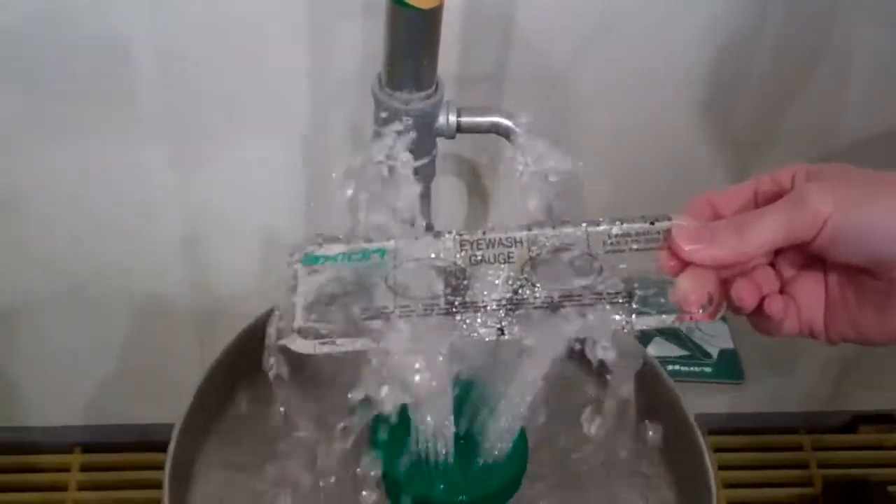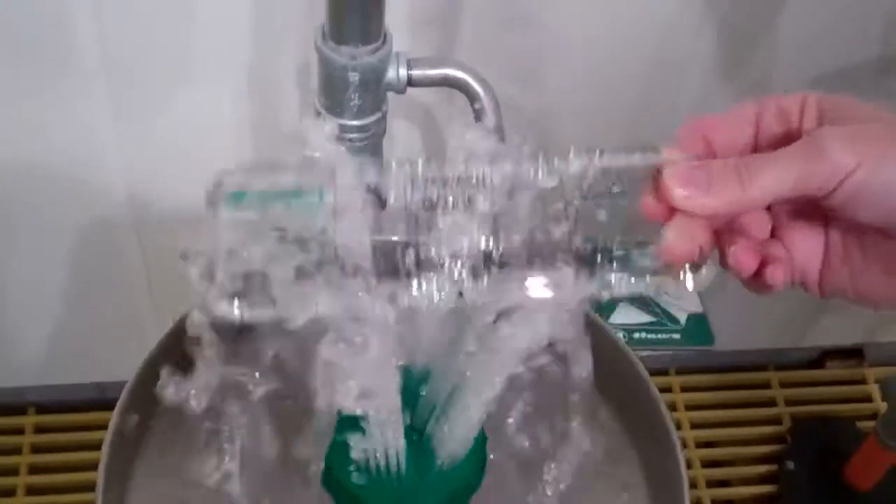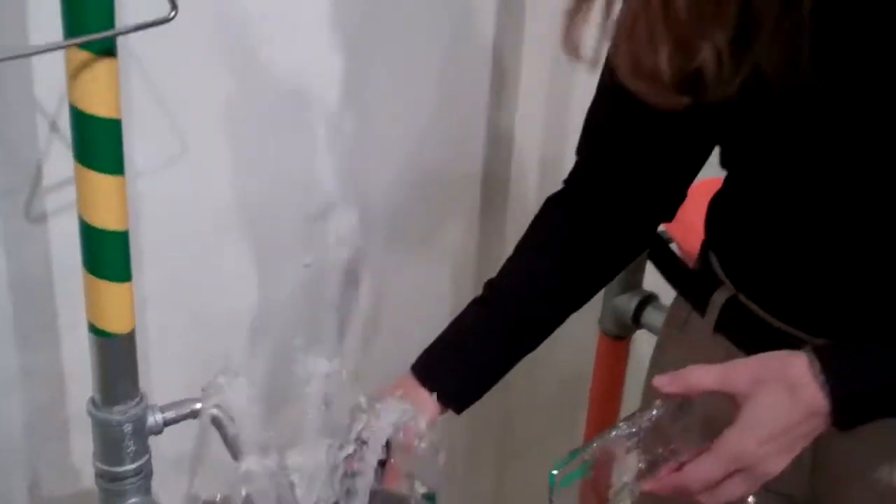You just want to make sure when you're testing that the flow is proper. If you have any questions, you can go to www.cosco.com or call us at customer service. Thank you!